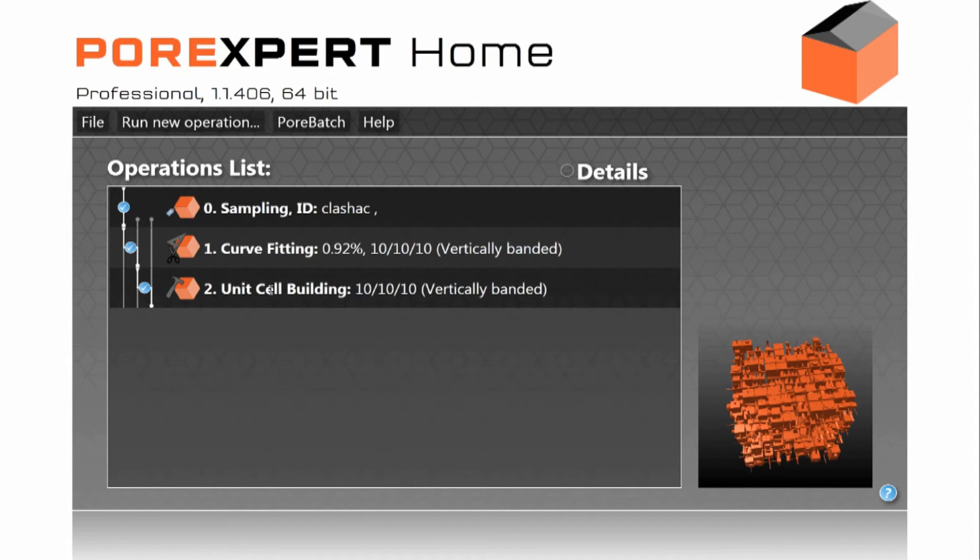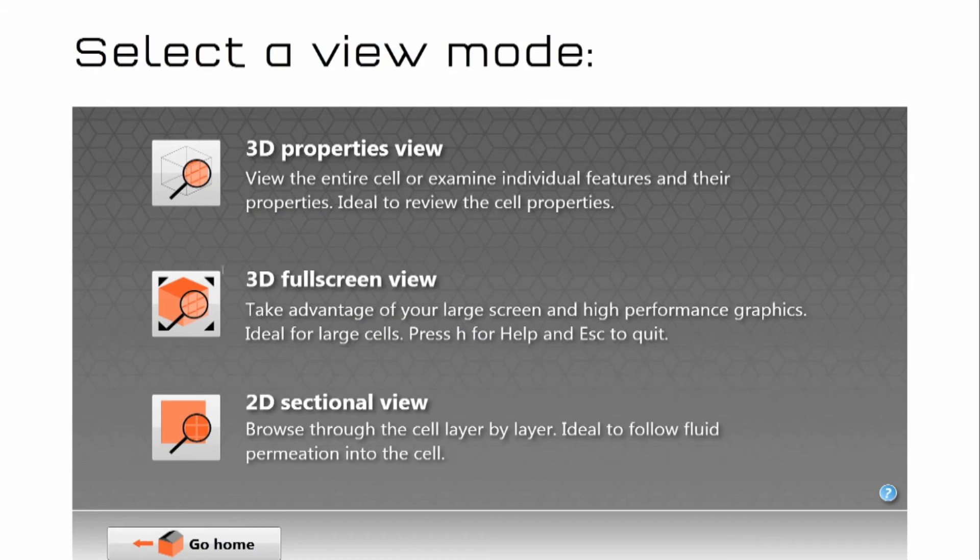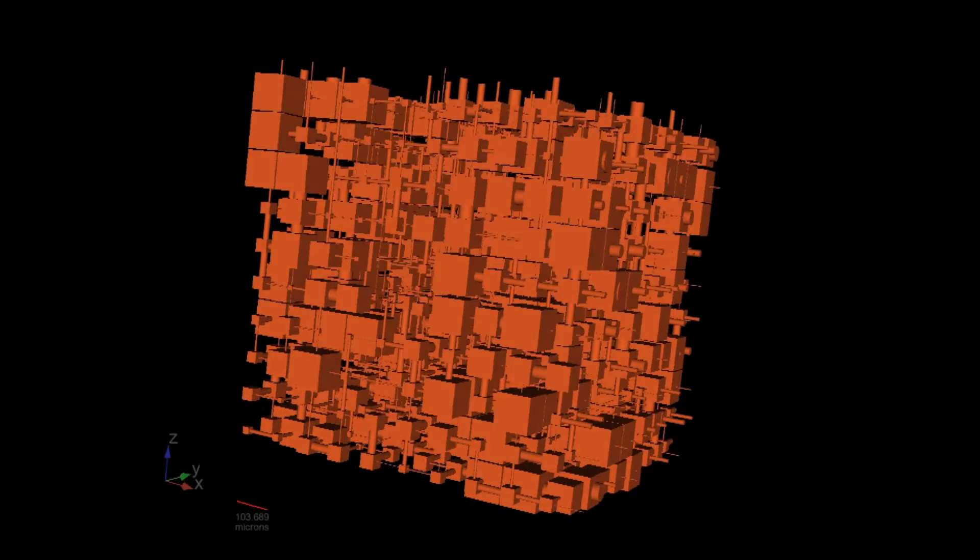There we have unit cell building. We click on that. Let's choose 3D full screen view.